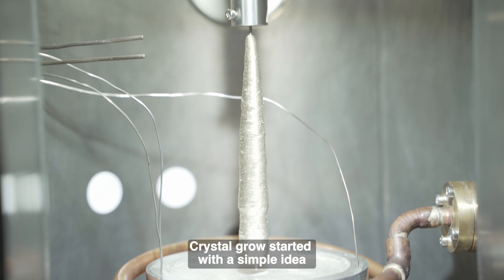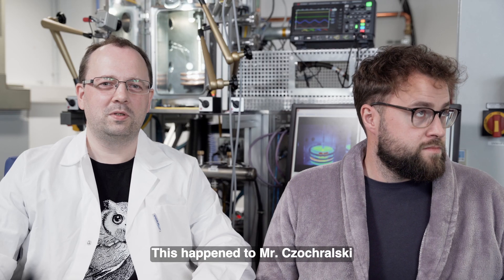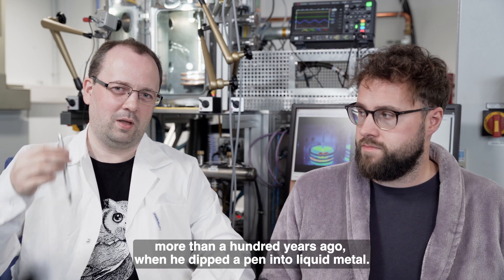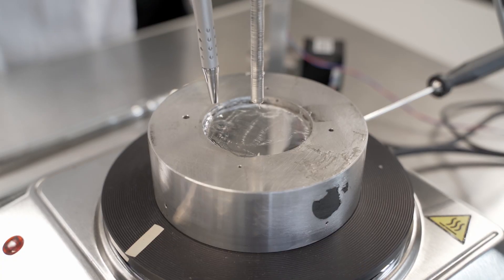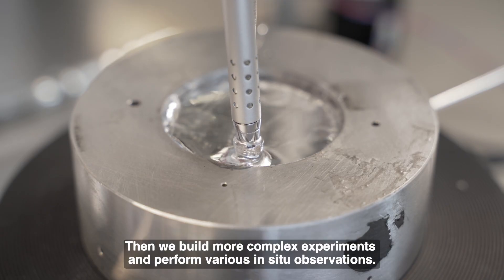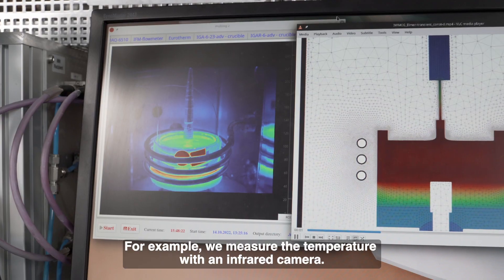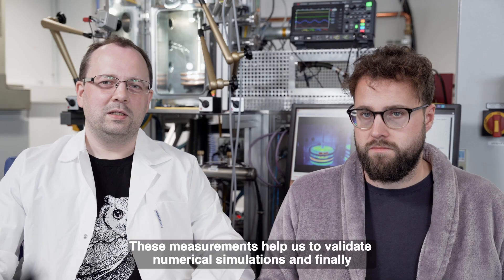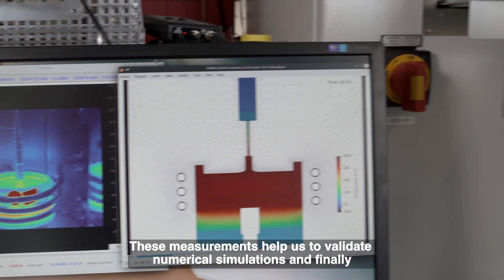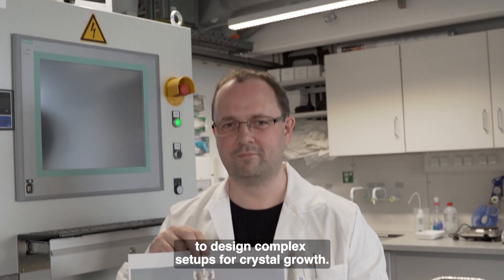Crystal growth started with a simple idea discovered by accident. This happened to Mr. Czochralski more than 100 years ago when he dipped a pen into liquid metal. Since then, we have built more complex experiments and perform various in-situ observations — for example, we measure the temperature with an infrared camera. These measurements help us to validate numerical simulations and finally to design complex setups for crystal growth.